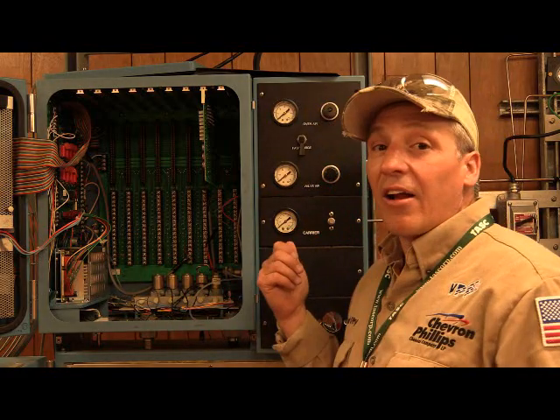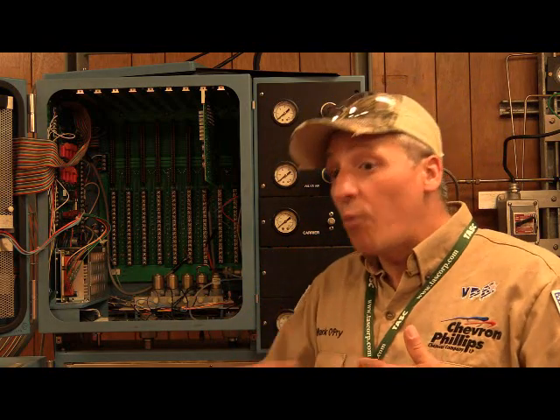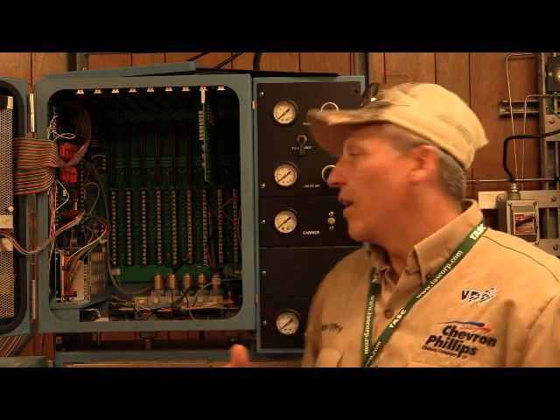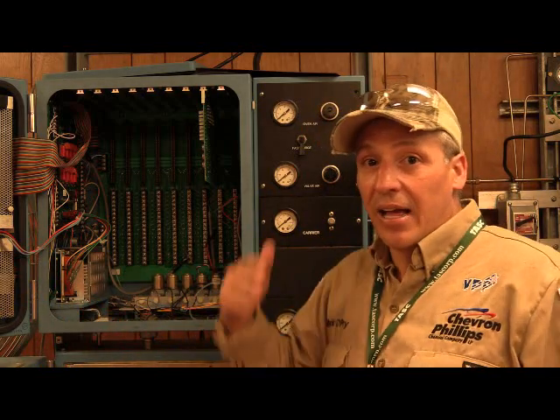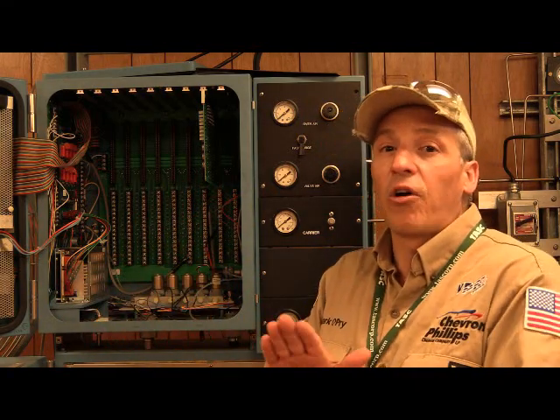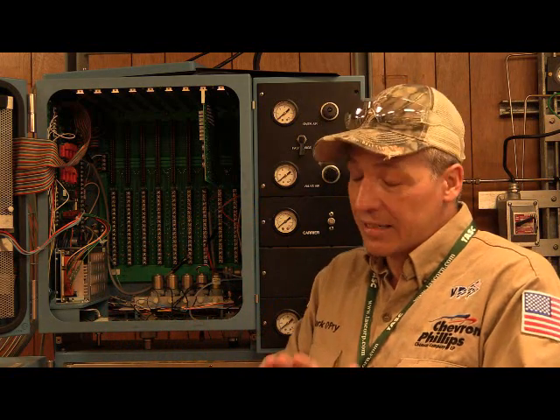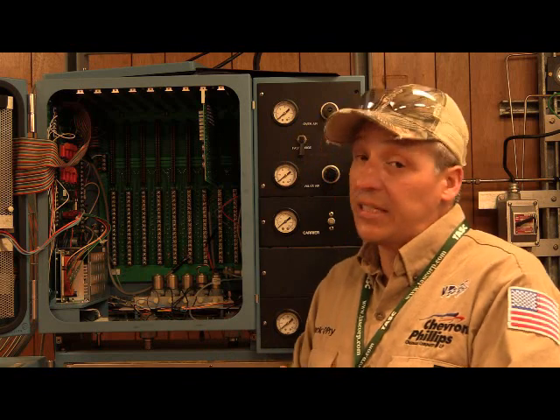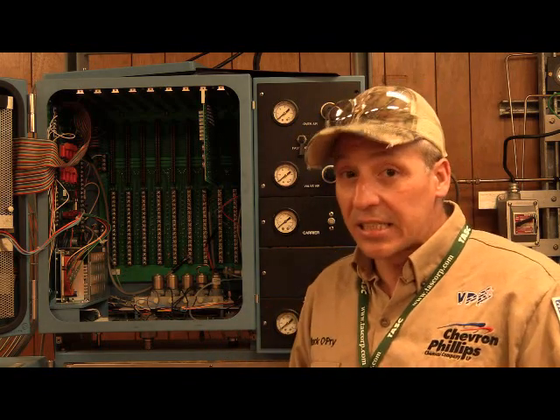The carrier regulator is what will tell you how fast your peaks come out, and as long as the carrier regulator is set and solid, then the peaks will come out at the same time, every time, time after time. GCs work on constants. Constants.